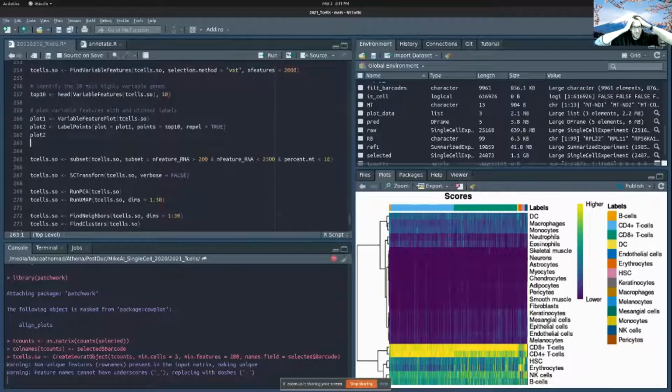Okay, that was awesome. Thank you so much for giving that. Honestly, I learned so much just watching you go through this. So this was really, really cool. And I had no idea that the as.Seurat function is a trap, because I kind of assumed that since as.SingleCellExperiment works, it would work the other way, but I'm now thinking maybe it doesn't.